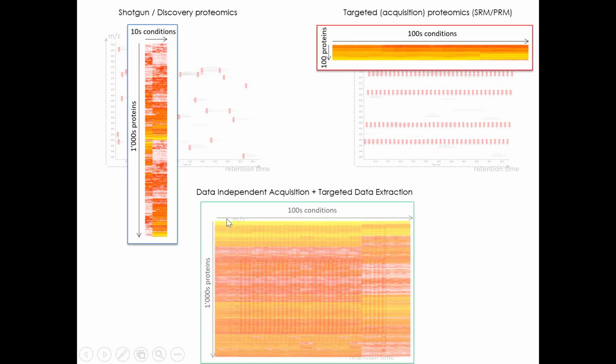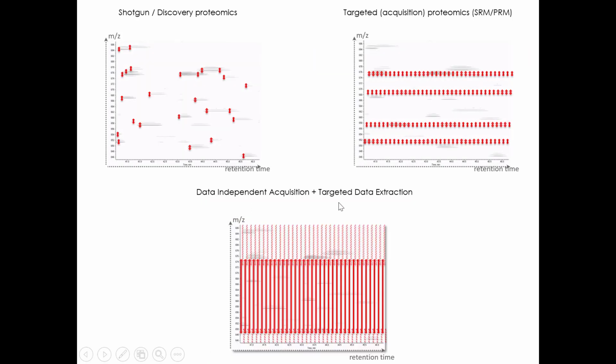And then we have now the DIA technique that we talk about here, that would cover basically the whole range of this peptide field, area of retention time and precursor mass, and all the peptides are fragmented, no longer as individual peptides, but as packets. And so we generate composite peptide spectra from each of these packets, and then we have to deconvolute them after to learn how this precisely functions and what the technical pitfalls are.